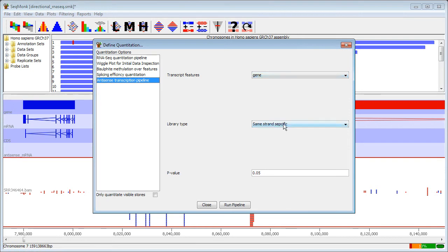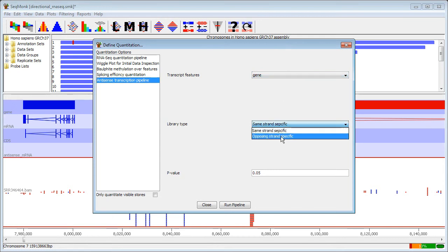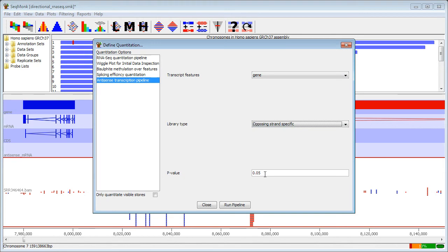We're going to tell it which kind of directional library we have. In our case it is an opposing strand-specific library, and we're going to specify the p-value for the set of automatically identified antisense genes that are going to be discovered.